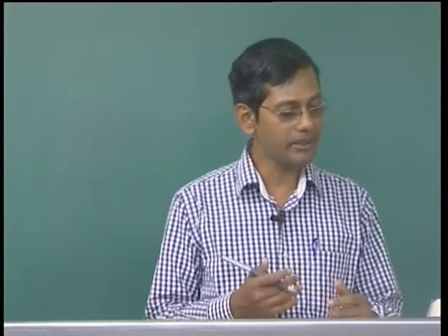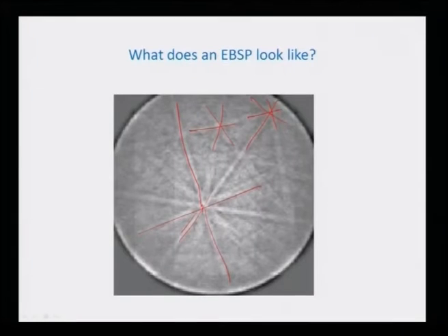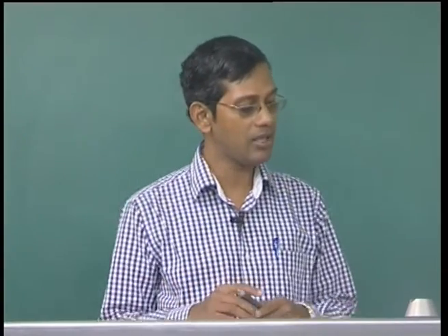Obviously, if that is the case, then this can be related to lattice spacing, and we can get information regarding the crystal, the atomic spacing or lattice spacing. The angular width of this band is approximately twice the appropriate Bragg angle for the given lattice spacing and the electron wavelength, so the lattice spacing can be deduced from the measured width after the angular scale of the pattern is obtained.